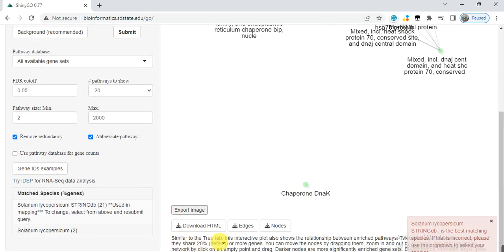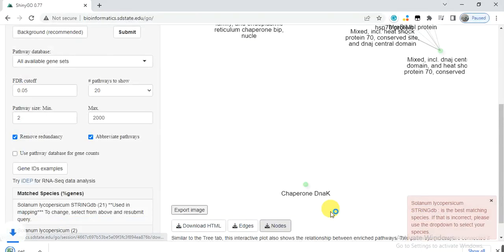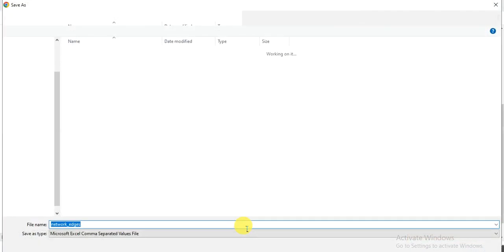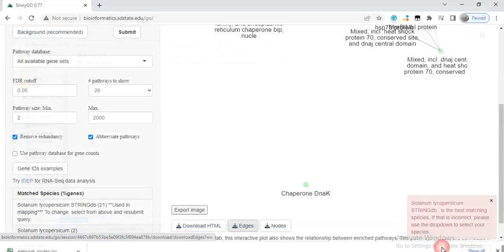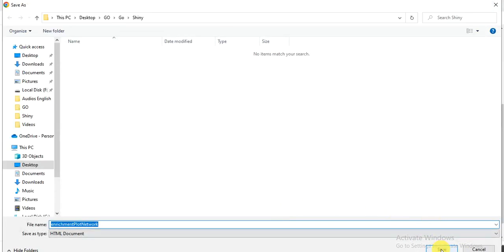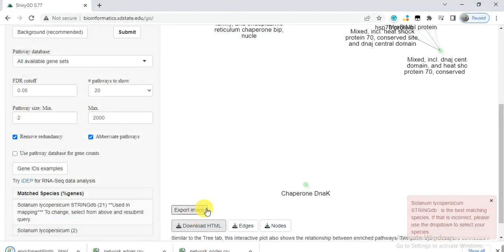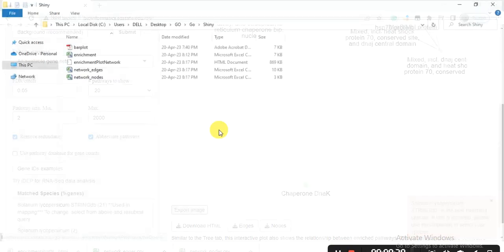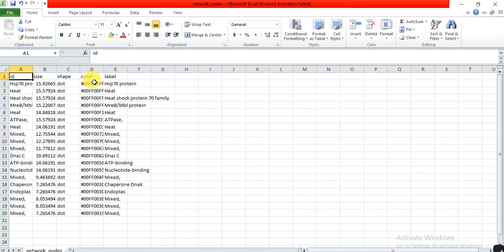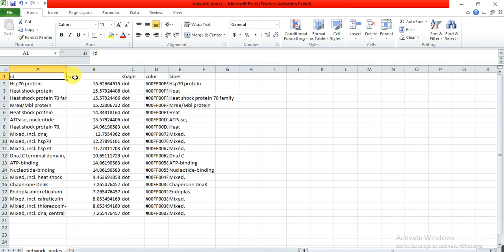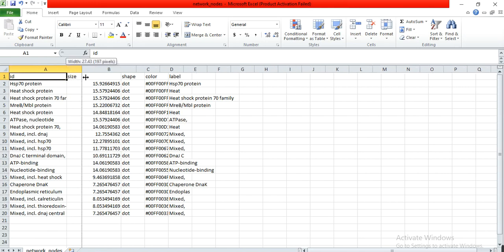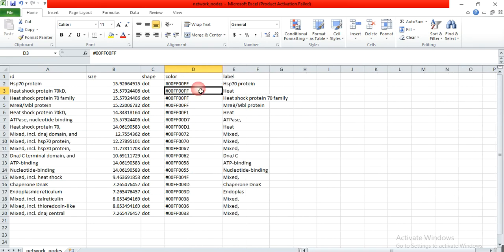Below, it will give the information about download HTML, the website, and here are the nodes and their genes, edges, and groups. Here is the color of that node.